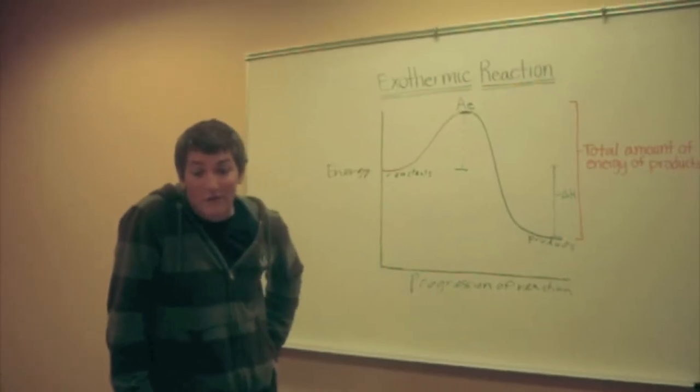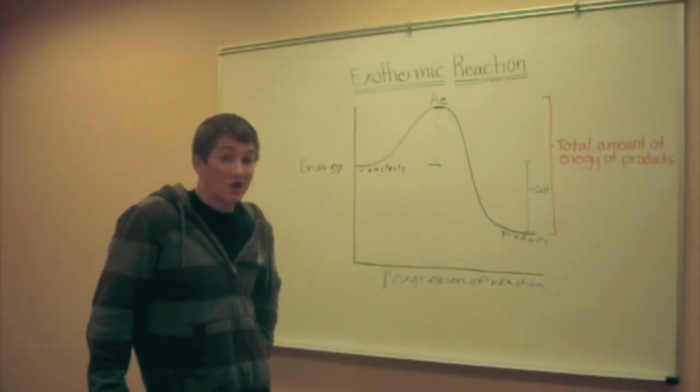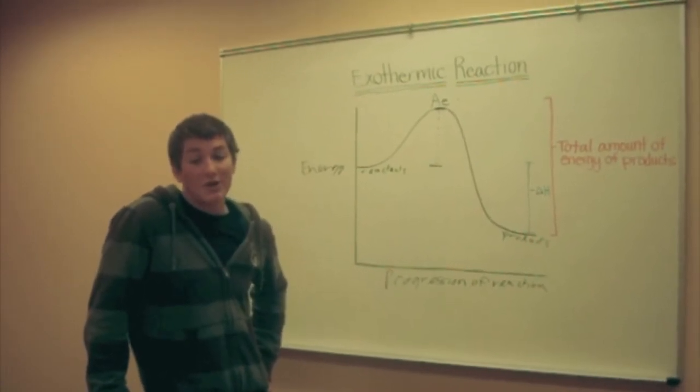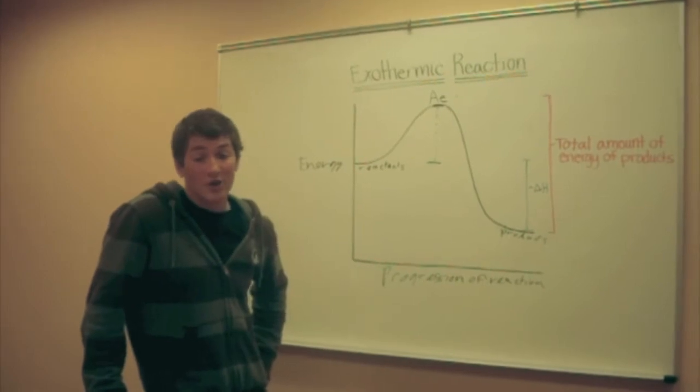We're doing an experiment called elephant toothpaste. This is an exothermic reaction experiment. In an exothermic reaction, the energy released is greater than the initial energy. In other words, the output is greater than the input.